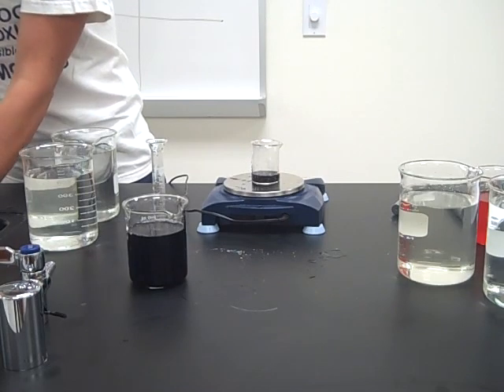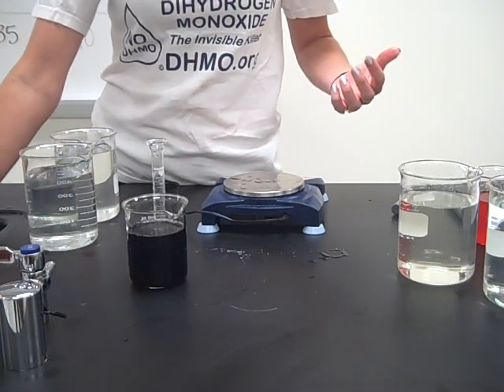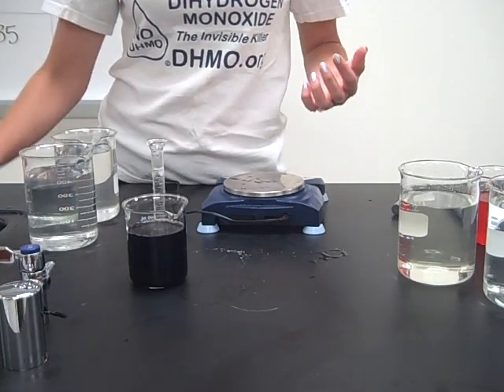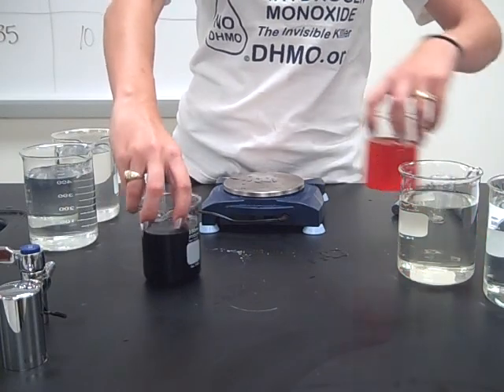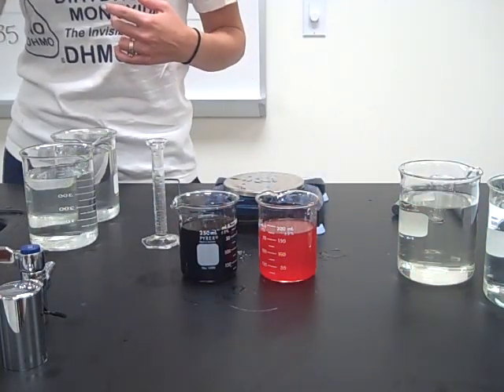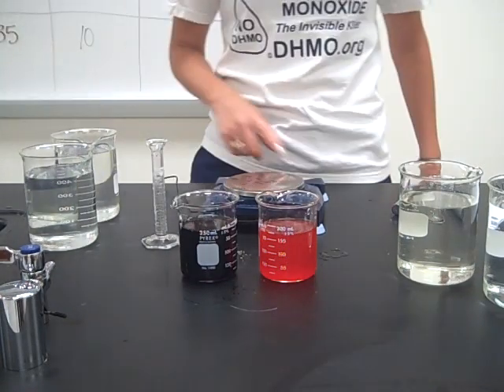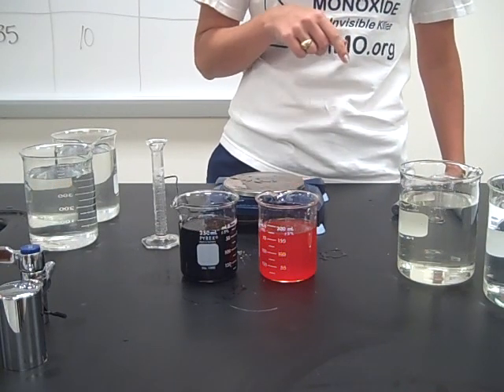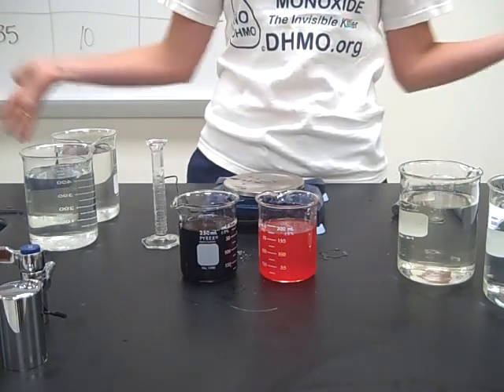Now what you would do with the masses of these two solutions is take the mass divided by the volume of 10 milliliters, figure out the density, and then use the graph that you drew with the standard solutions to figure out the sugar concentration of your two unknowns. Then you can use the nutritional data to actually calculate the sugar content of your beverages and do a percent error comparison, which I will show you how to do in another video. That's all we got — you all have a great night.